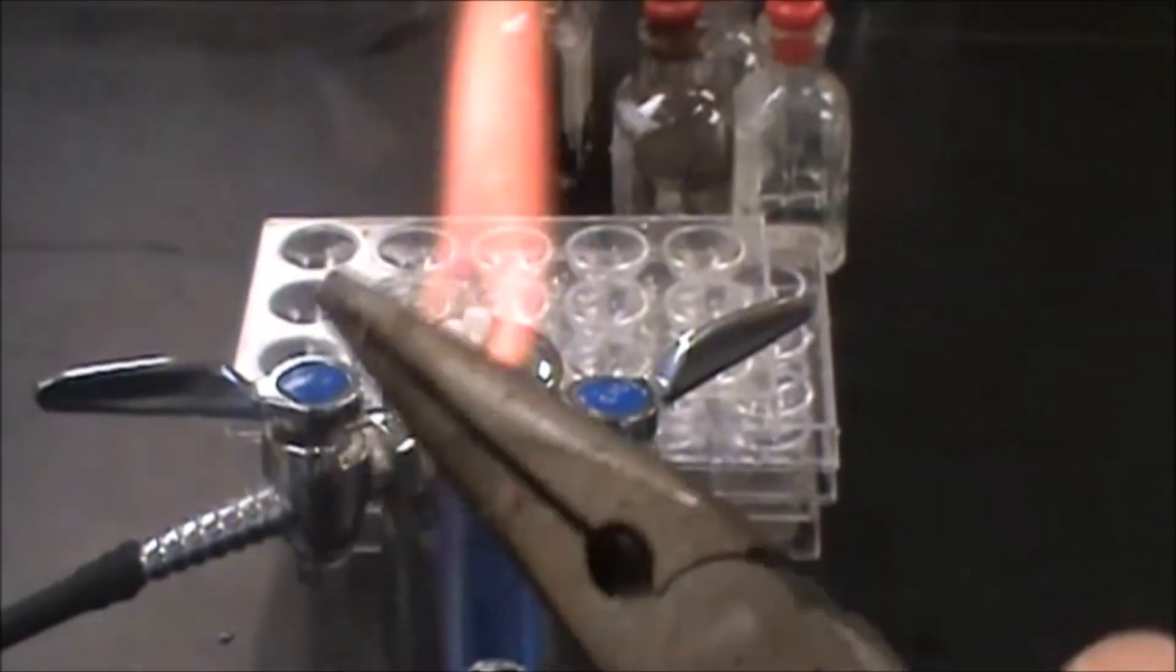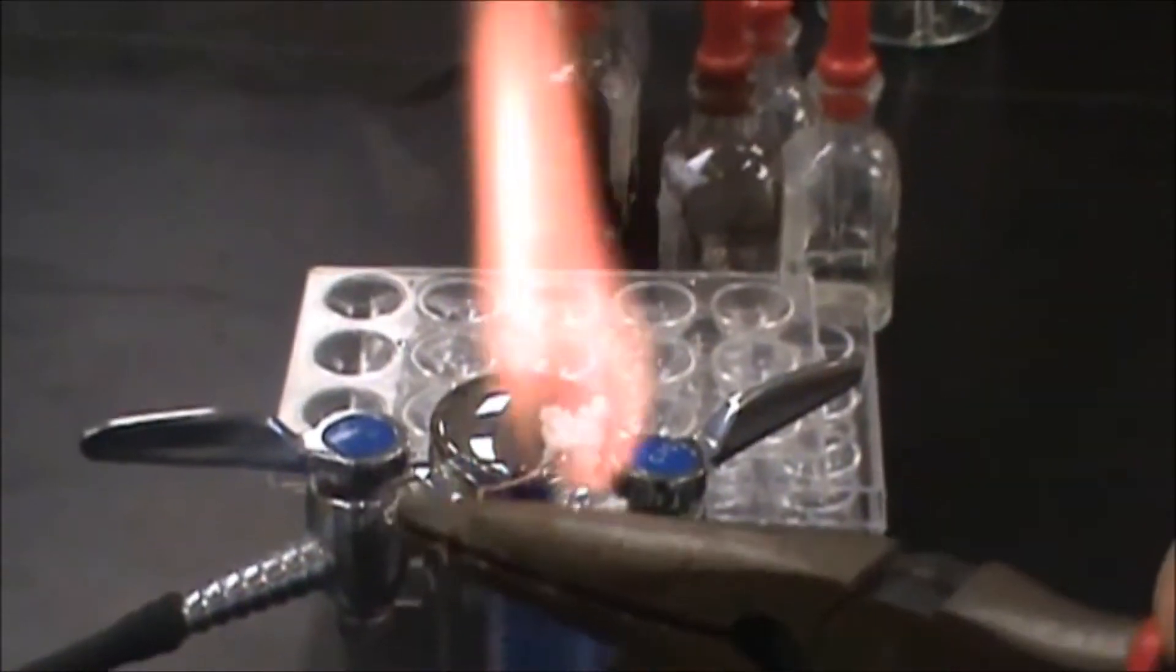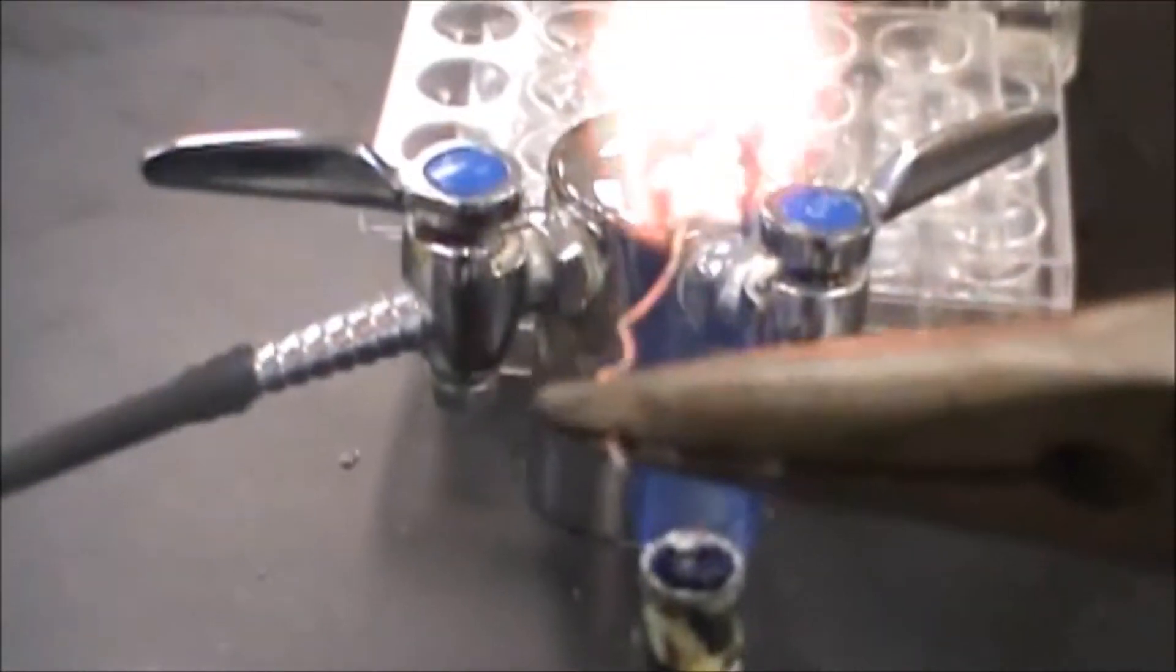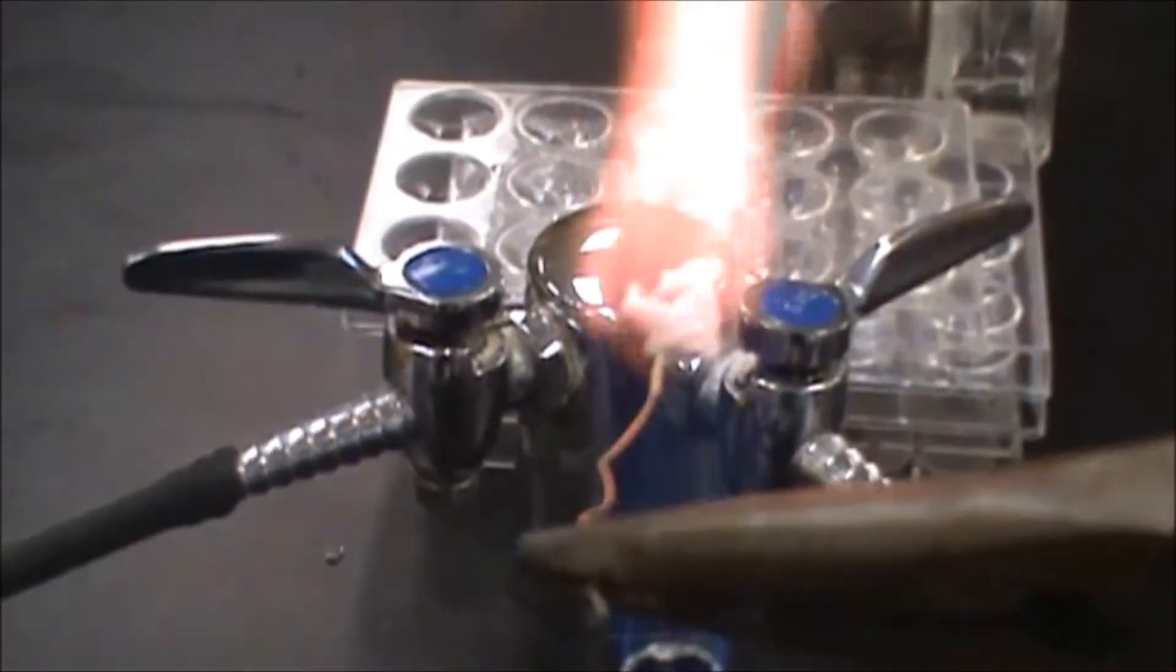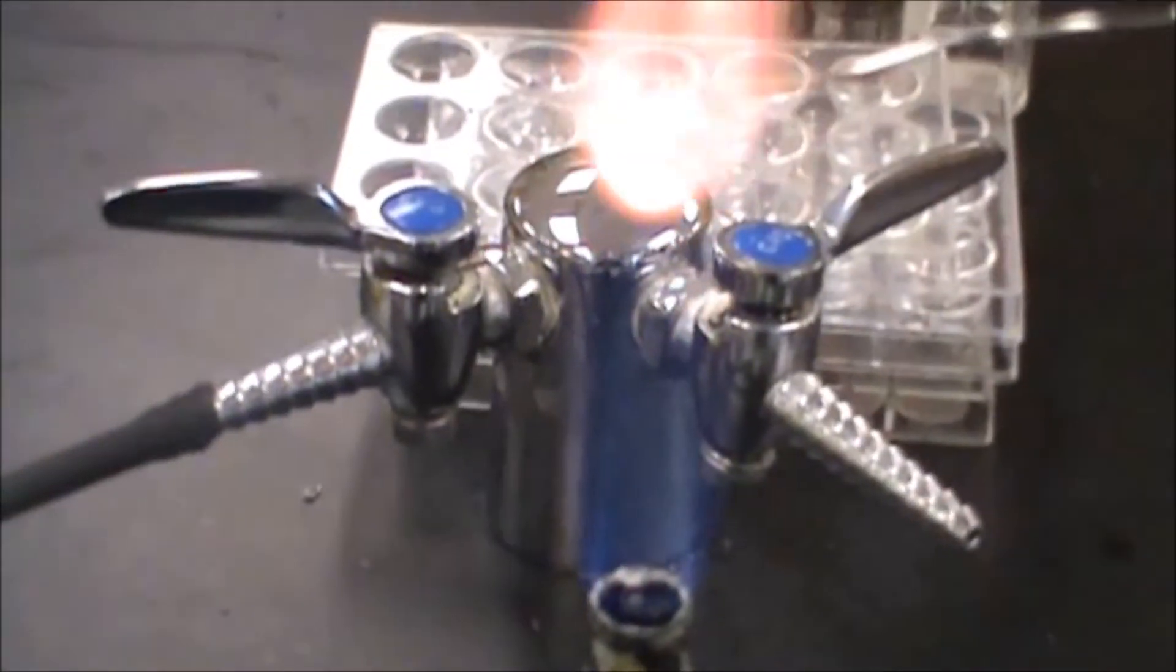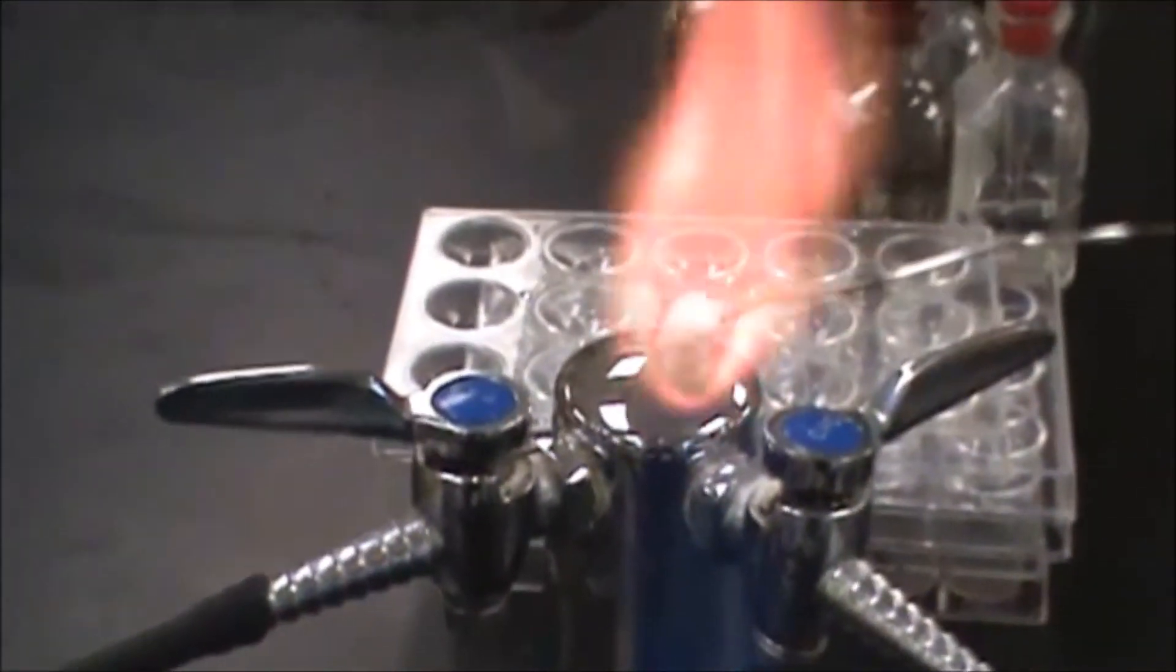We're going to melt that into a bead. It generally takes a couple applications to get a big enough bead because it's going to shrink down a lot when it gets to the very end and it actually melts. What we want to get is one solid blob as best we can.